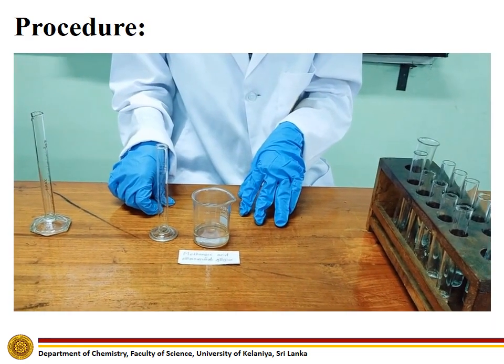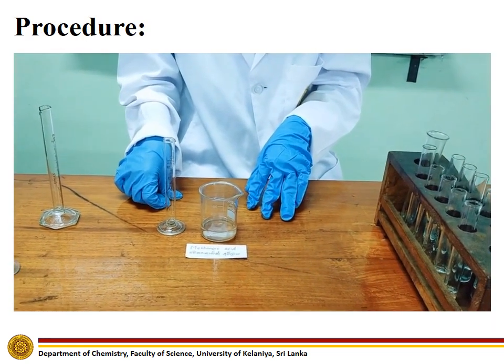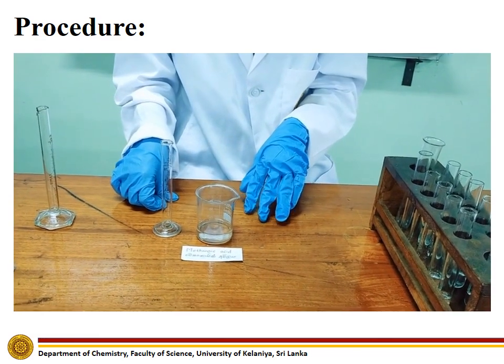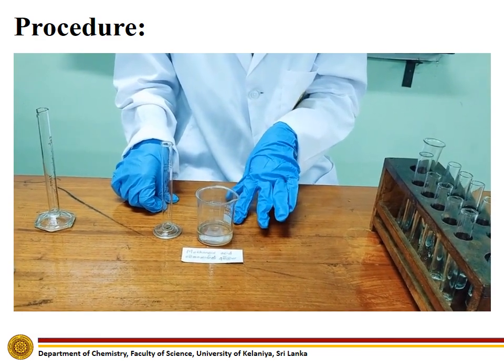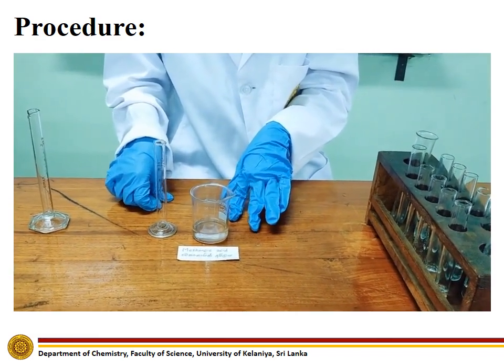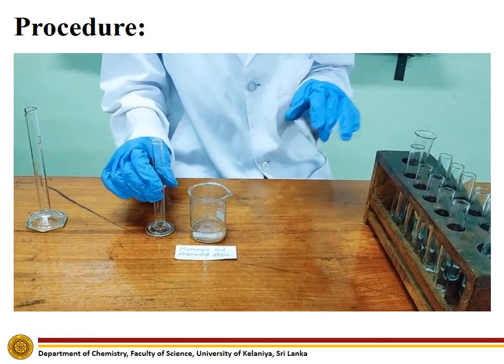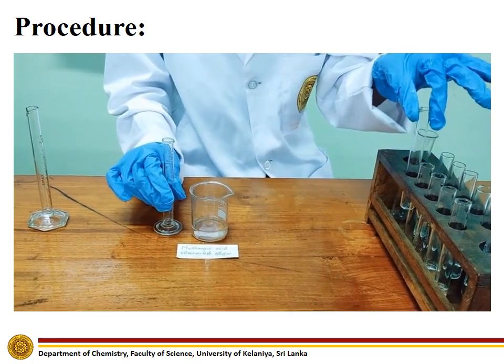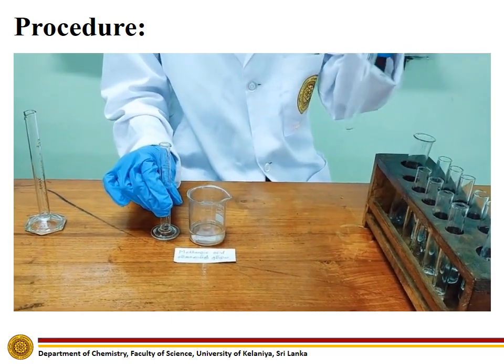Next, we are going to perform all the experiments on methanoic acid. For that, measure about 2 ml of methanoic acid into 6 separate test tubes.